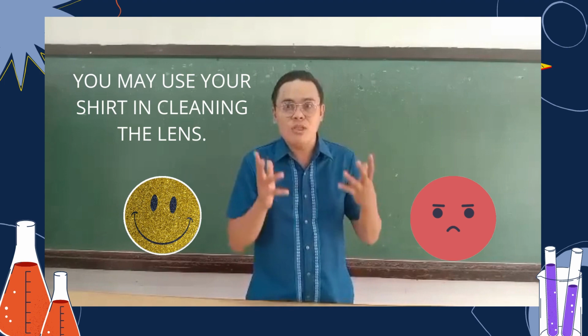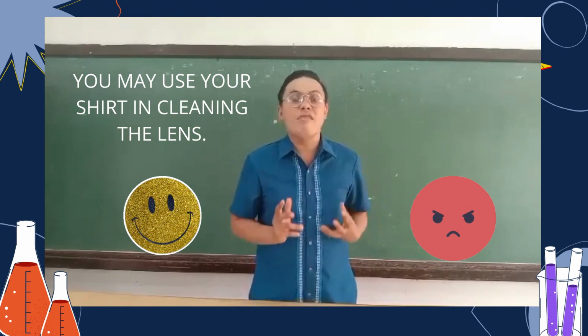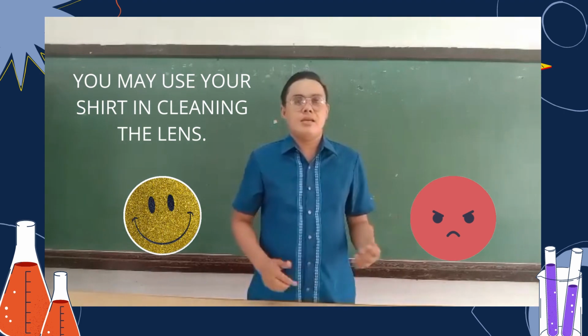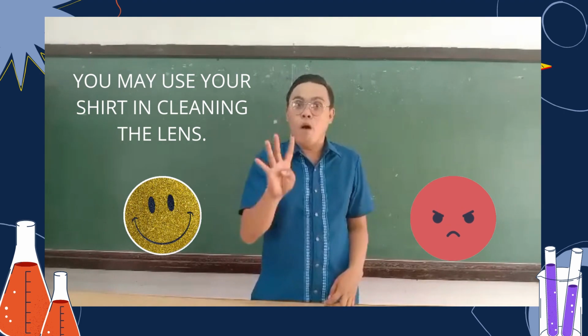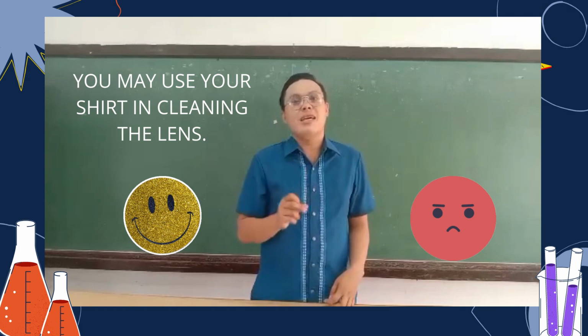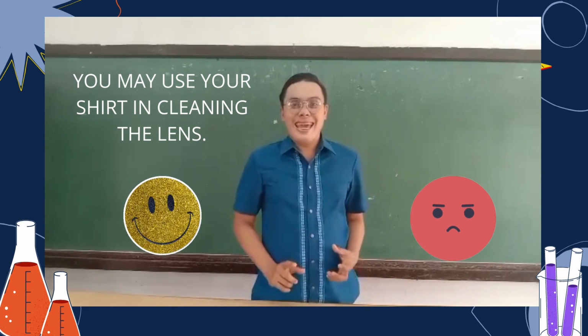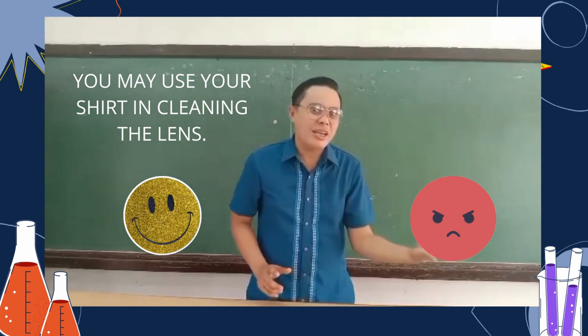You may use your shirt in cleaning the lens. Is it in a happy or an angry face? In 5, 4, 3, 2, 1. Great! It's angry face!